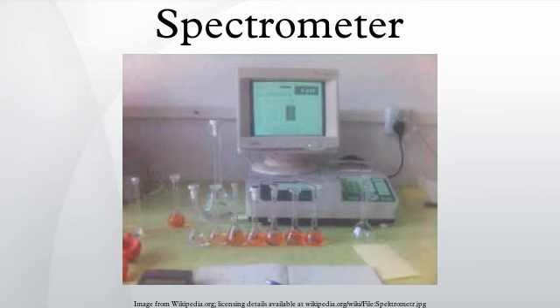Spectroscopes. Spectroscopes are often used in astronomy and some branches of chemistry. Early spectroscopes were simply prisms with graduations marking wavelengths of light. Modern spectroscopes generally use a diffraction grating, a movable slit, and some kind of photodetector, all automated and controlled by a computer. Joseph von Fraunhofer developed the first modern spectroscope by combining a prism, diffraction slit and telescope in a manner that increased the spectral resolution and was reproducible in other laboratories.